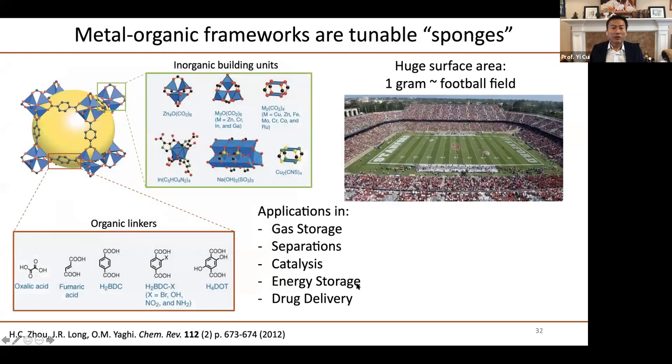So with this battery demonstration, we were excited and asked: what other important energy materials are there where atomic scale resolution is still challenging? We move on and look at the MOF, metal organic framework. This has a very porous structure, with open channels, a lot of gas molecules and ions coming in. It's important for gas storage, for catalysis and so on. But obtaining atomic scale resolution is very hard. Obtaining the gas molecule configuration down to atomic scale is also very, very challenging.